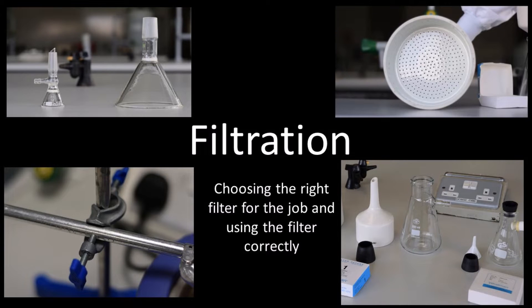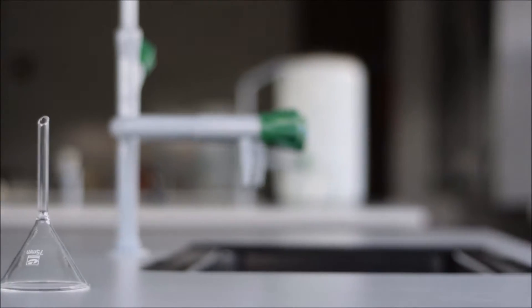This video is all about choosing and using the right filter for the job in the chemistry lab. There's quite a few options when it comes to choosing a filter, so let's have a look through them.